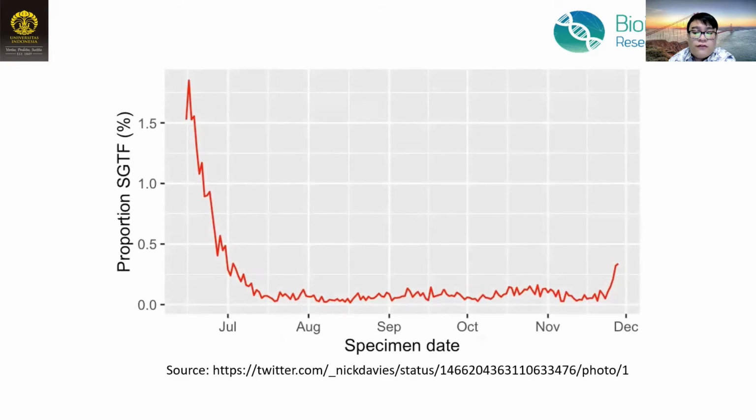This is the graph of SGTF proportion in the UK. At the end of November, we can see the proportion of SGTF tends to increase.